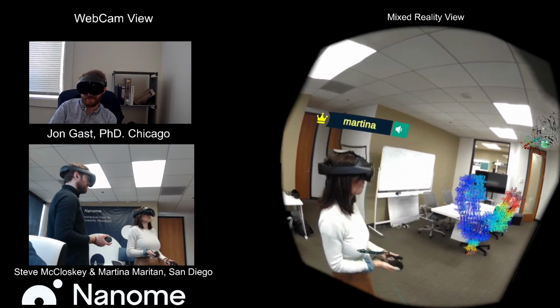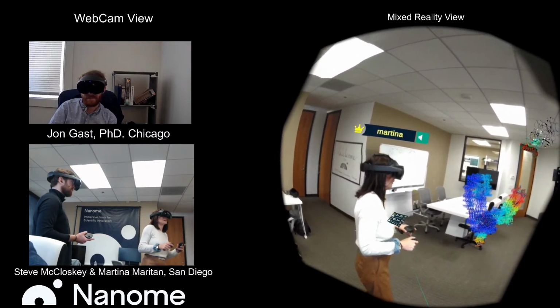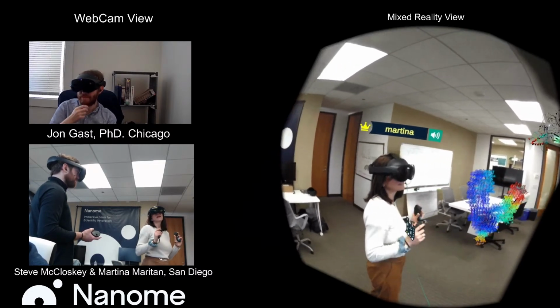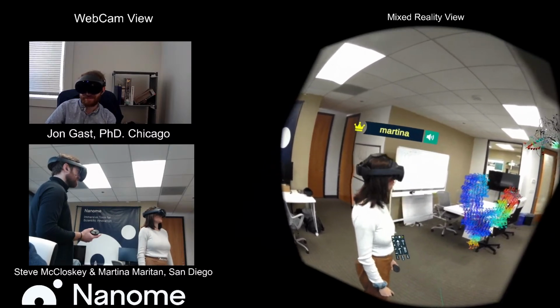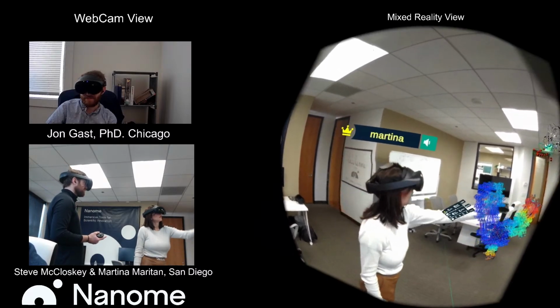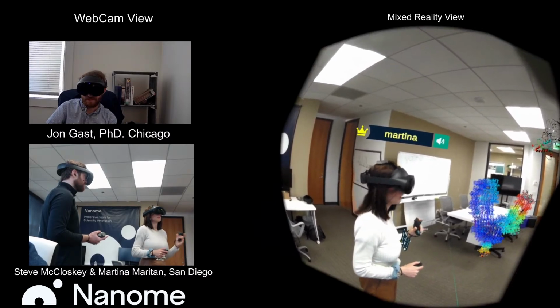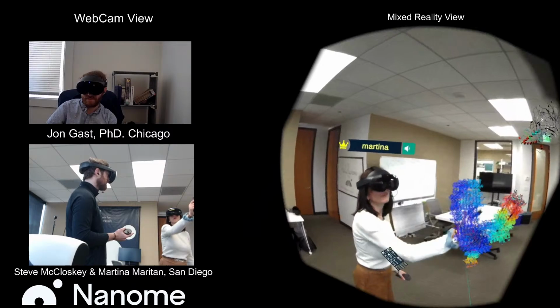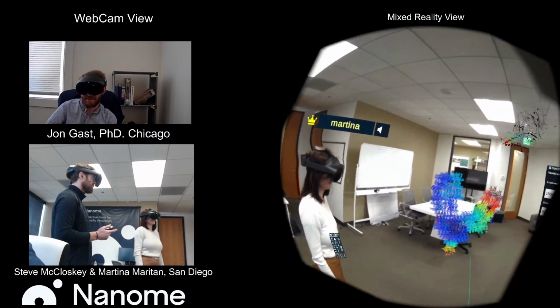The advantage of having access to experimental maps is that it tells you where the truth is, what it is that we are really seeing. Absolutely, the two things have to go together. Obviously, coordinate models are super useful, we use them all the time, but you always have to remember they come from original densities. Great point.